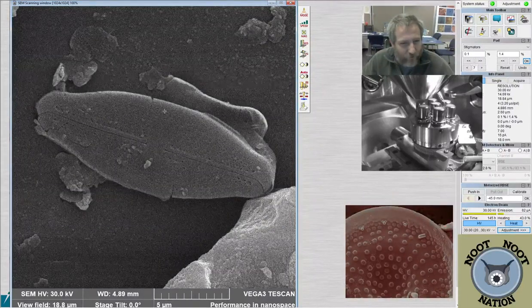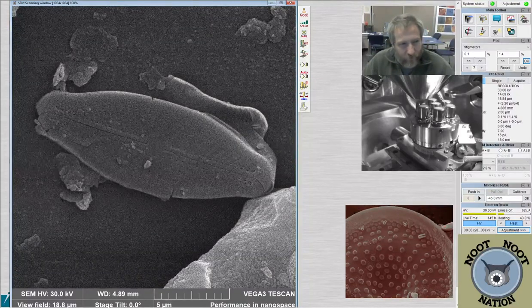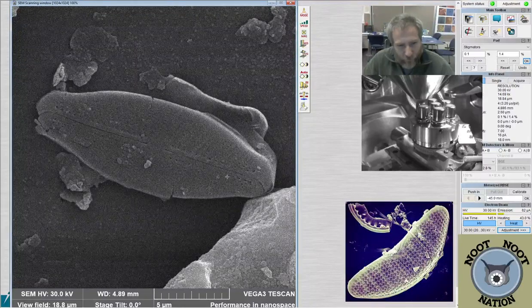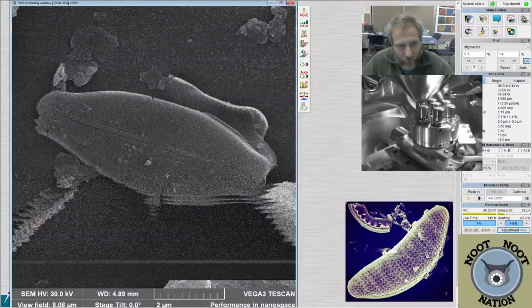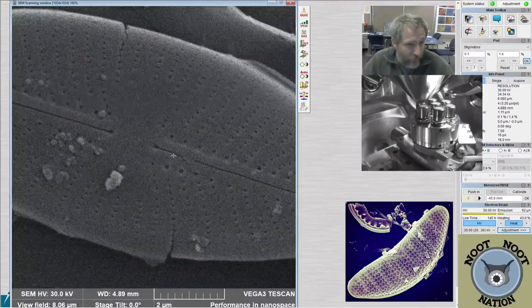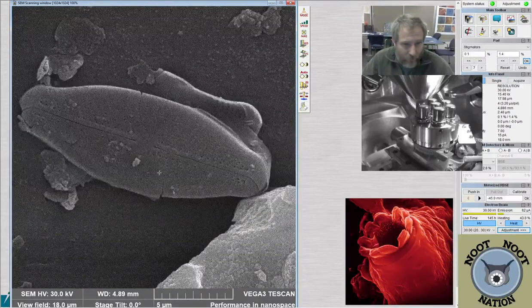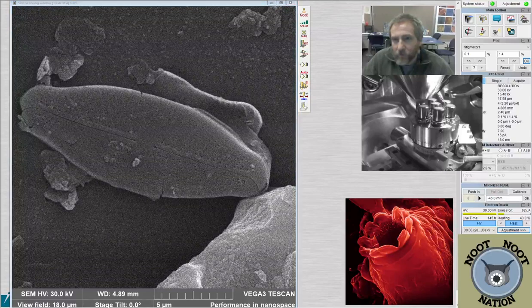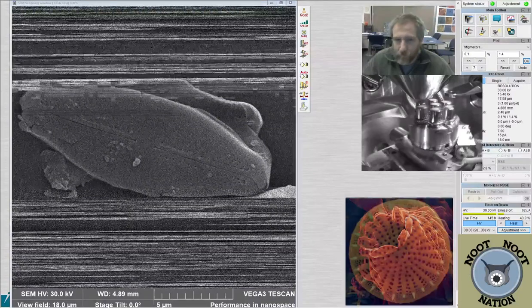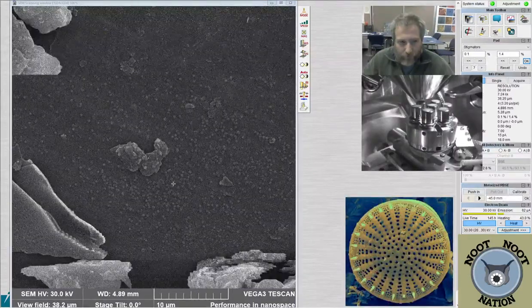Maybe Sellaphora. That's kind of an interesting looking diatom. It's got these really distinct holes next to the actual raphe. Cosmioneis, maybe? I don't know. I should probably get a picture of this one. To rotate it a little. Rotated it right out of the field of view.